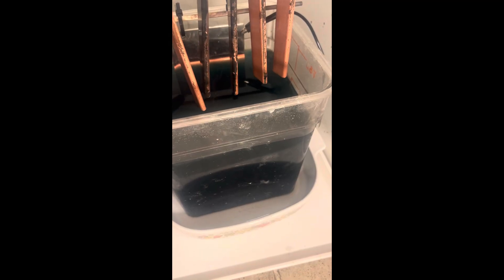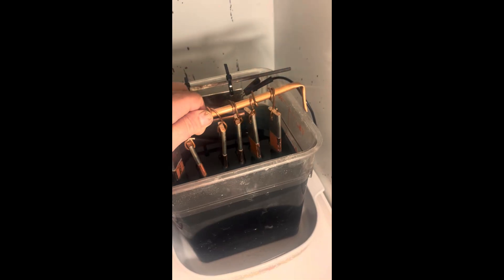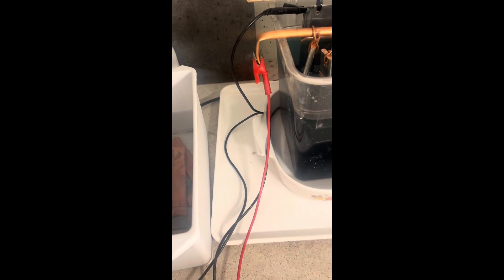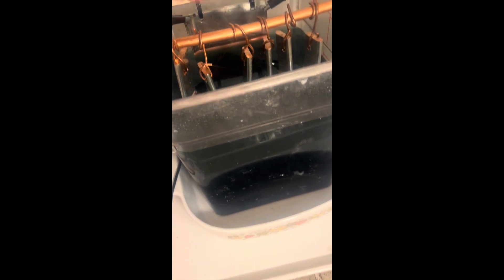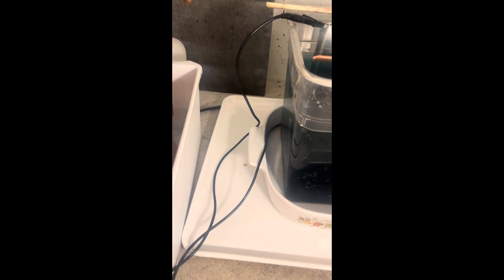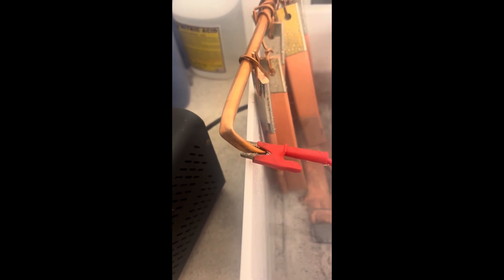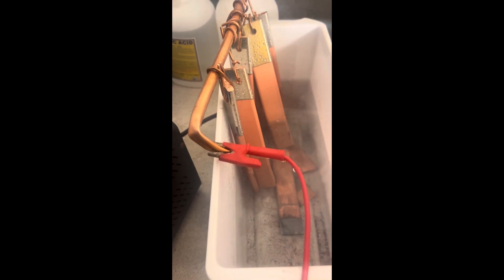Almost there — I feel like I could squirt that stuff off. We'll power down and take a look. Yeah, that stuff is looking pretty good.